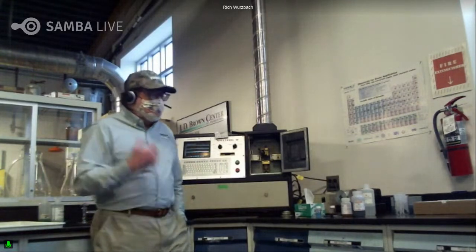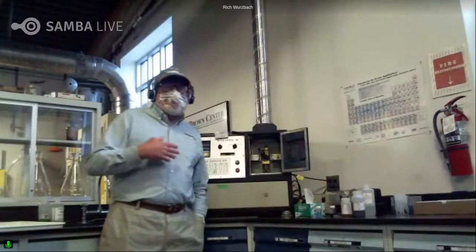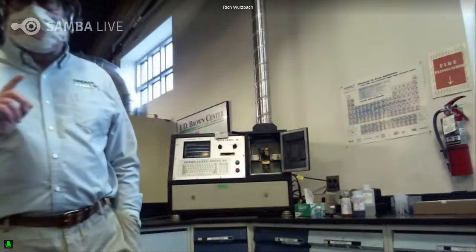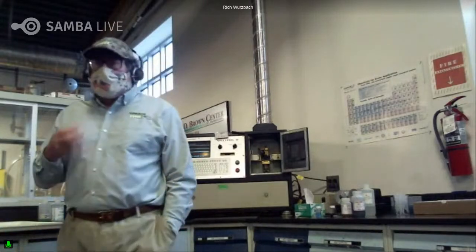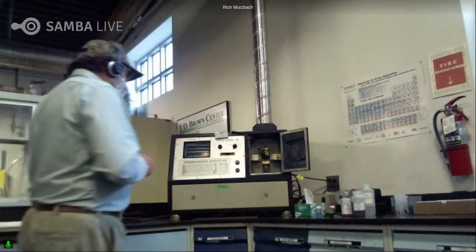So we do learn a tremendous amount by looking at the values that we get out of RDE spectroscopy, but it's one set of data that we really want to be complementary to other things that we're discovering with our full test slate of grease analysis.